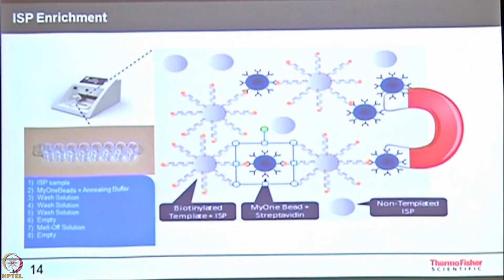Now we said that there could be some of those water droplets which, when the emulsion was being created, did not get a library molecule, so they will not get amplified. But we do not want to take them on the chip, because they are still going to occupy some space on the chip. So why lose data? At the enrichment step, when we were doing amplification on the ion spheres, one of the primers was biotinylated. So now all the amplified ion spheres are biotinylated. We are using streptavidin coated beads to fish out all the amplified molecules, and all the rest remain in the solution.